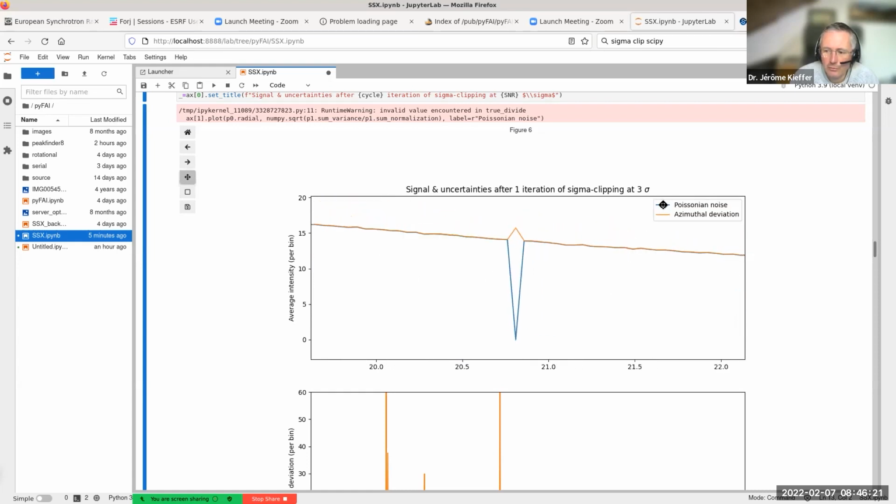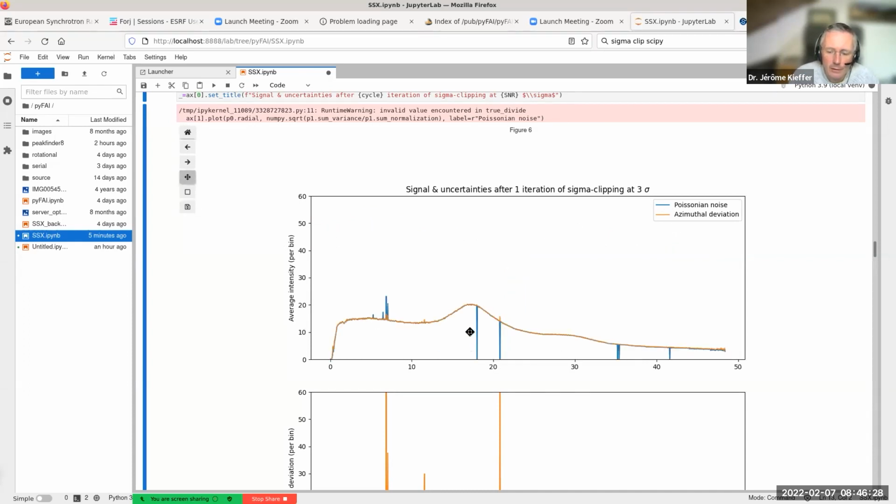This occurs mainly with the Poisson distribution. So the fact that peaks have disappeared is a feature we are looking for. The fact that some bins are getting empty and ending up with 0 values is something we are definitely not looking forward to.